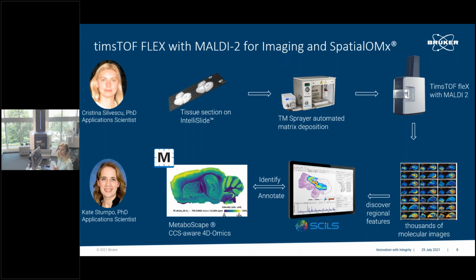These two features are very important in mass spectrometry imaging, especially when we are looking into biological samples, into the tissue environment, which is very complex at the molecular level. We want these features to allow us to efficiently ionize the compounds and also to separate them.